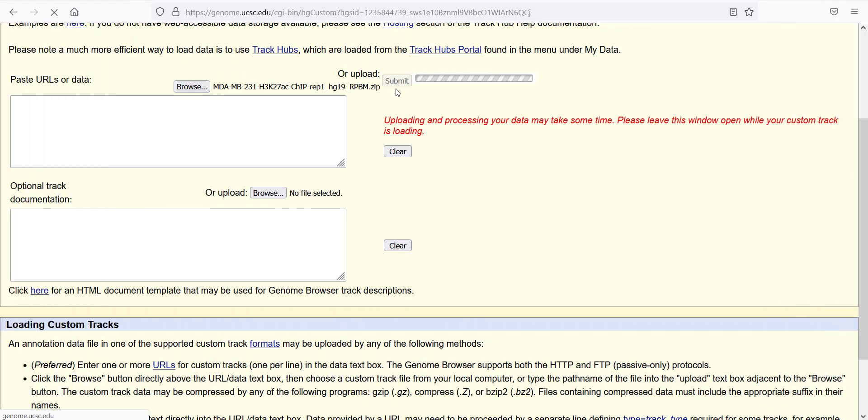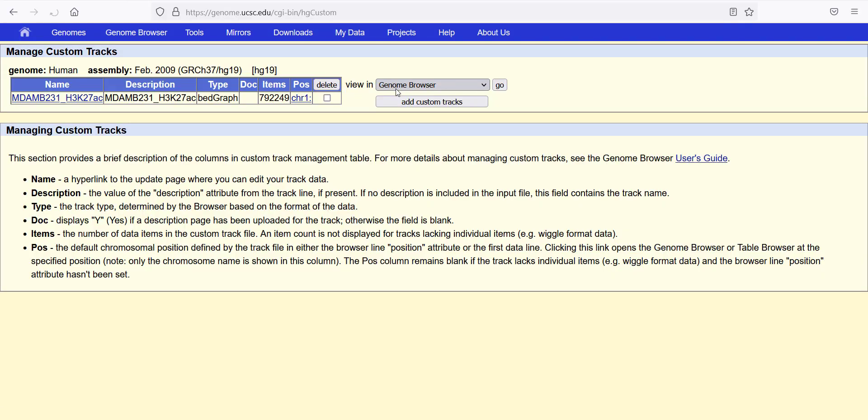This takes a few seconds to upload depending on the size of your file. In this case, I am uploading a bed graph. This is a ChIP-seq dataset for a triple negative breast cancer cell line, H3K27. Once it's processed and uploaded, you can go to Genome Browser directly.